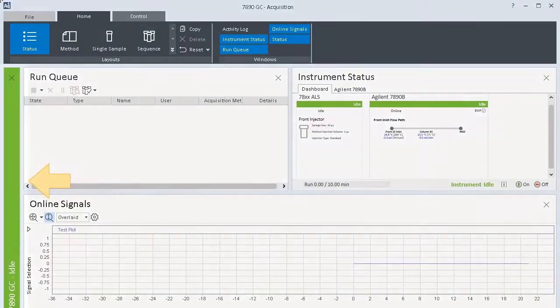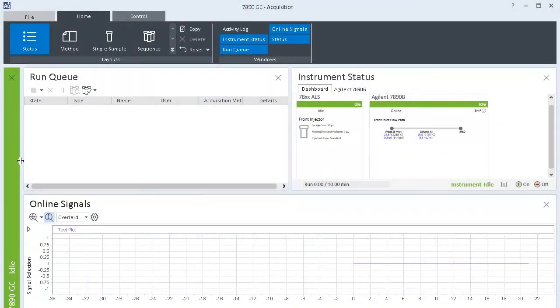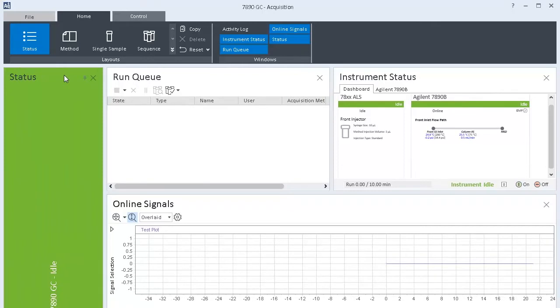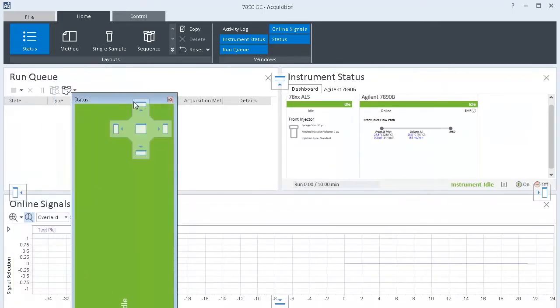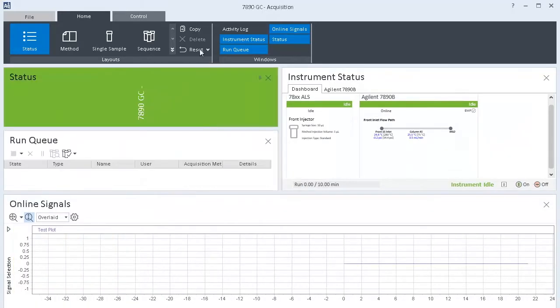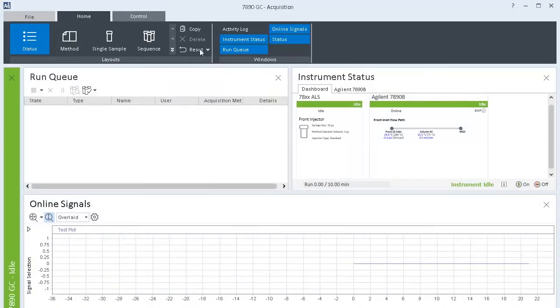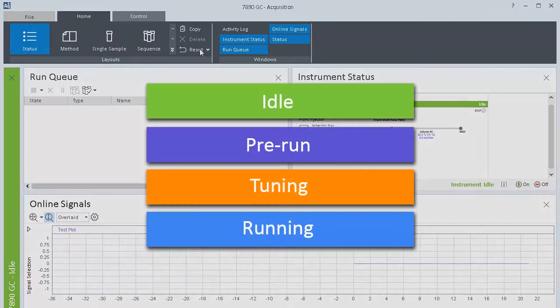In Acquisition, Instrument Status has its own window. You can size and move it for easy viewing. Unique colors represent each state, such as Idle, Pre-Run, Tuning, and Running.